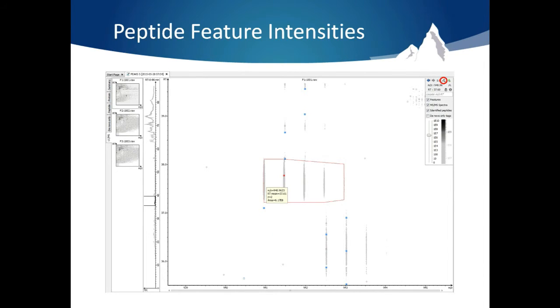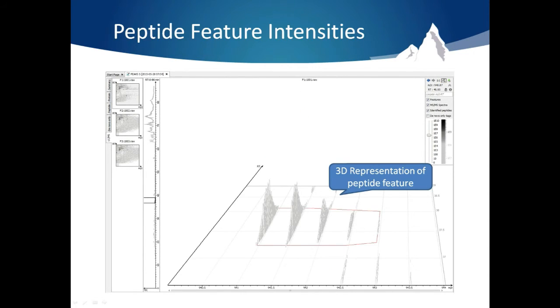You can even get a more intuitive 3D view of the peptide feature by clicking on the 3D button in the top right hand corner of the pane. From this view the peptide feature can be seen very clearly.